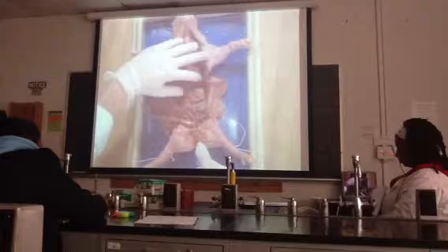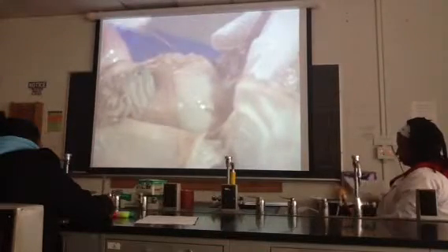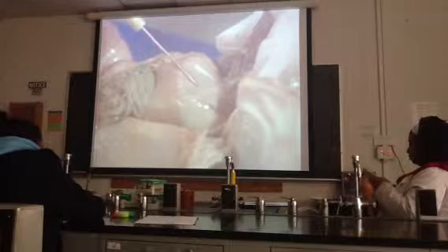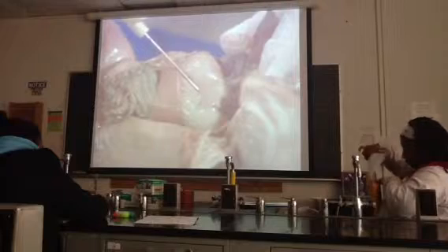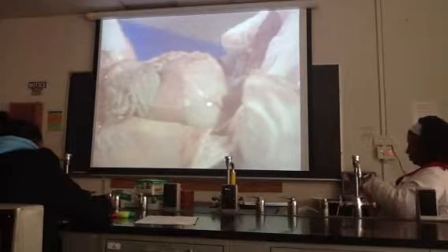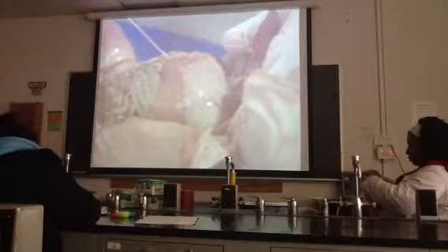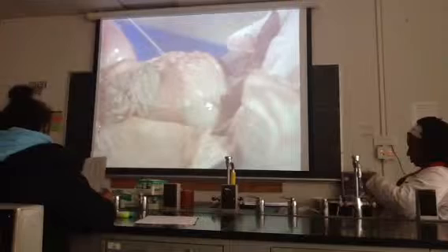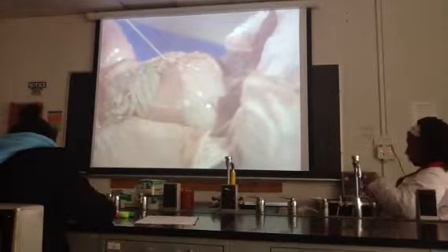On this side, underneath the liver, we see this large sac-like structure, which is the stomach. The stomach stores food and also chemically and physically digests it. Here in this curve around the stomach, we see this long reddish-brown structure, which is known as the spleen. The spleen functions in destroying old red blood cells.